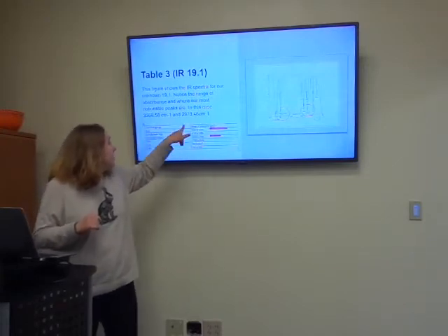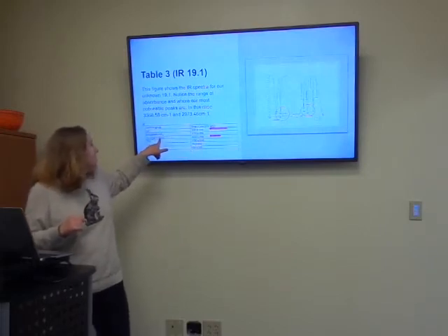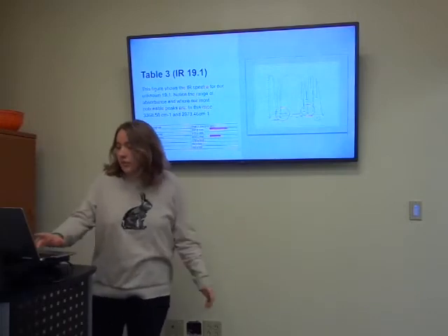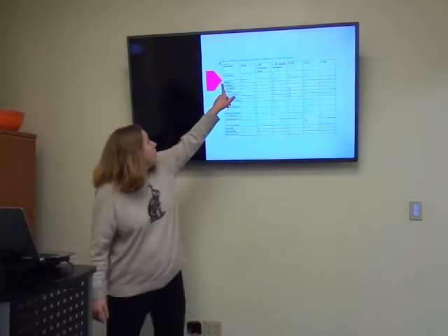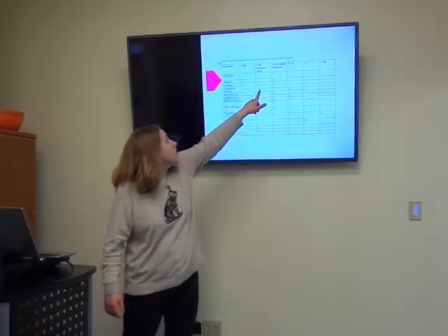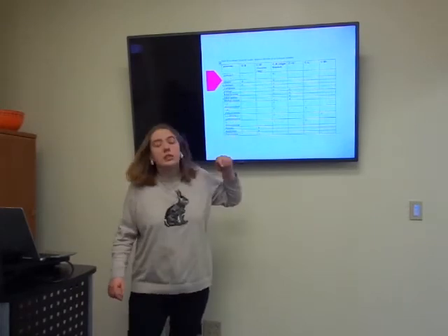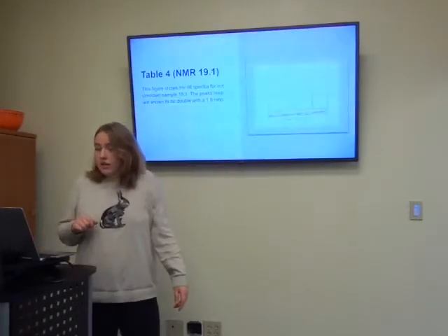And the second one, 2,973, falls in between the carbon to hydrogen single bond functional group. And of those, only 3, the methanol, ethanol, and 2-butanol, have both the oxygen to hydrogen and the carbon to hydrogen single bond.